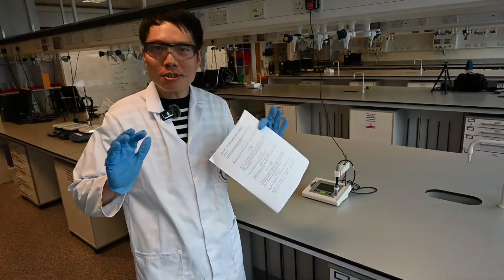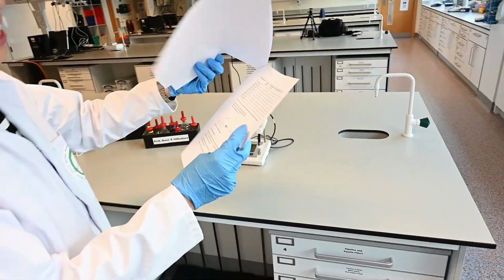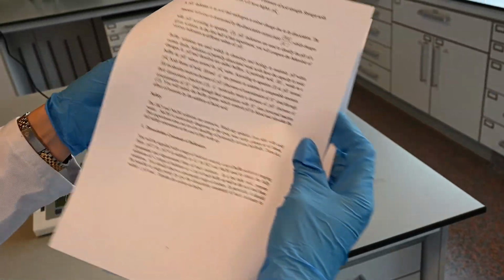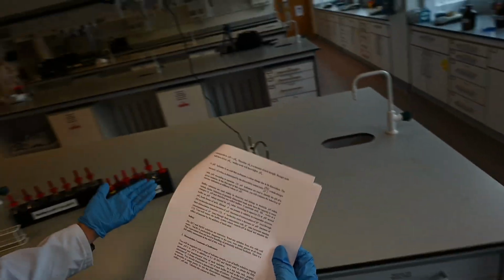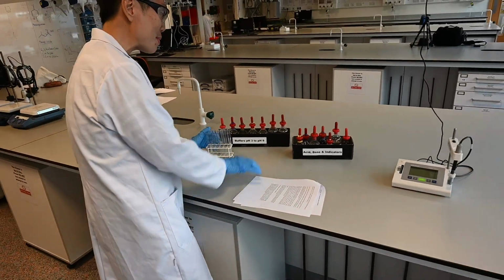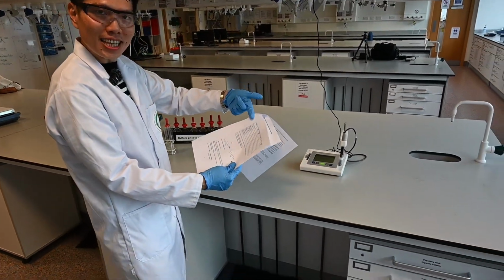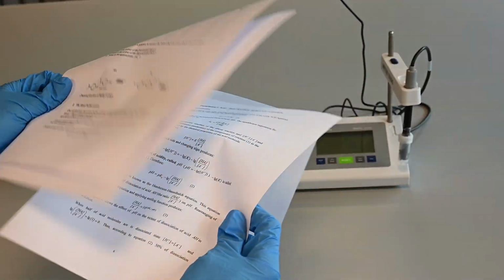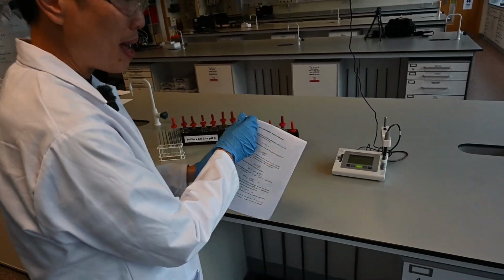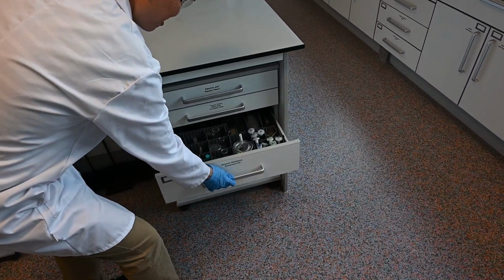Essentially, there are only two little tasks you've got to do. The first one is about checking color, okay? What it means is, you will just be taking your test tubes, adding chemicals, seeing the color, and putting it on the table. That's it, very simple. To do that, remember, all your apparatus and glassware are here. You take it from here.